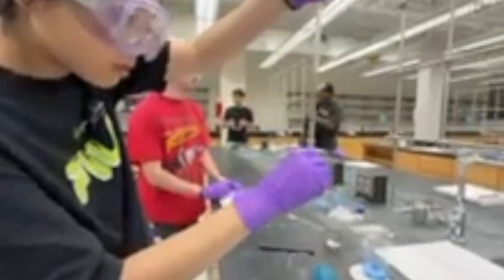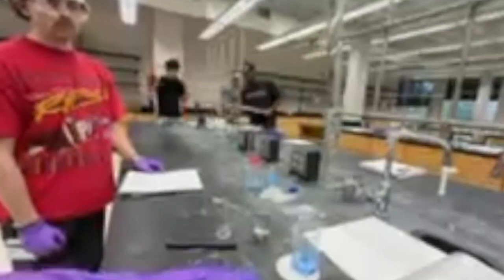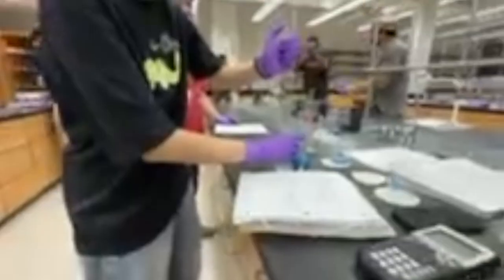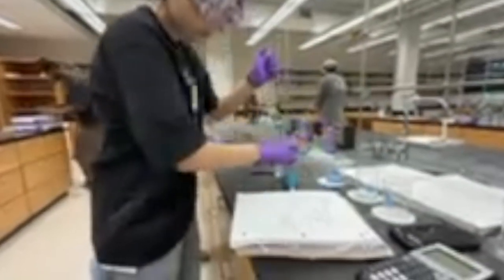The meniscus is that curved surface we see when a liquid sits in a glass container, like in a graduated cylinder or a burette. It's curved because the liquid molecules are attracted to the glass wall more than to each other, so the edge gets pulled up slightly while the middle stays lower, for most aqueous solutions anyway. When we're measuring the volume, we're supposed to read from the bottom of the curve, not the top.